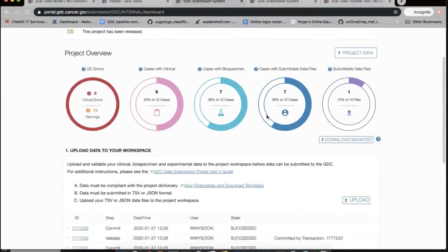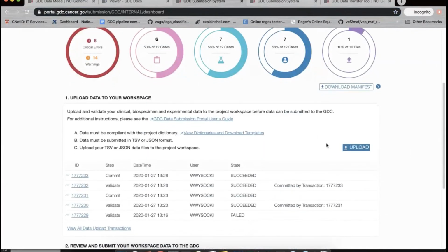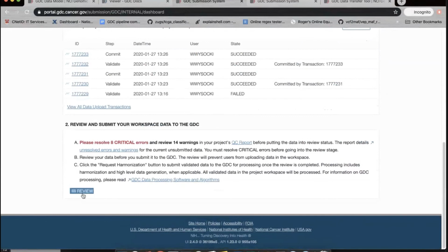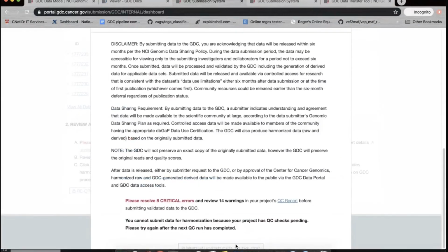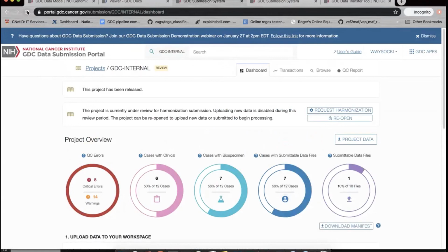But let's say I go through the submission portal and I upload 100 BAMs. And I know 300 more are coming 5 months from now, but I want the first 100 to be harmonized as soon as possible. So what I would do is submit the first 100, go down, click review, resolve all of my critical errors, and request harmonization, and there would actually be a button here that I'd be able to do that with. Now those 100 BAMs are in the queue. They are in the GDC's hands at this point, and will be harmonized in the order that they're received, or in the order that they're in the queue.